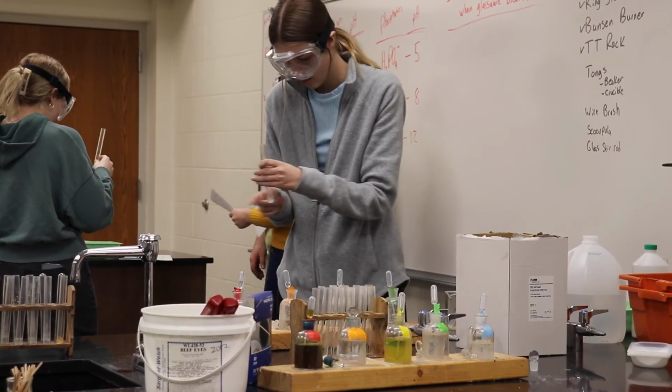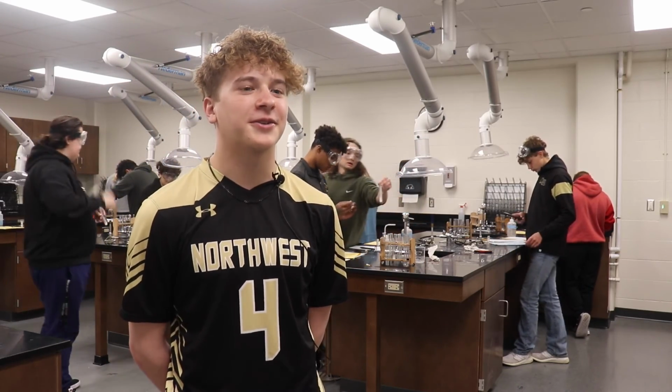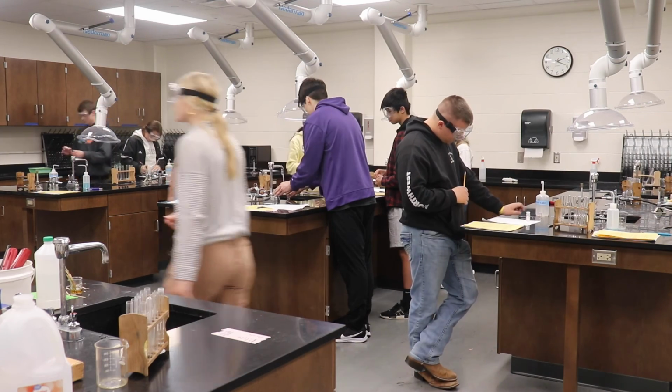We're not writing on papers and stuff, and it's technically like a test, so we're not doing a paper test, we're just experimenting. Good luck to the juniors as they finish their studies through qualitative analysis.